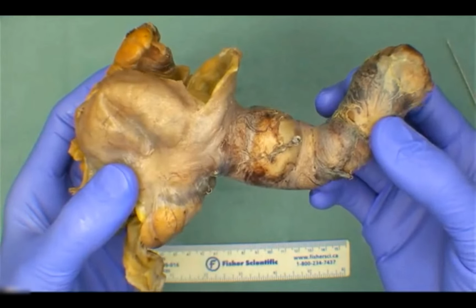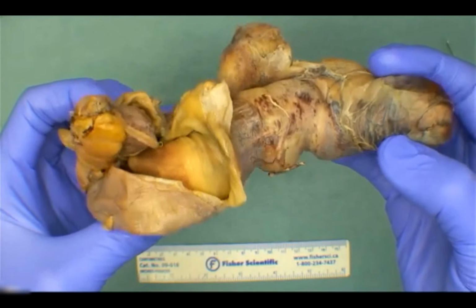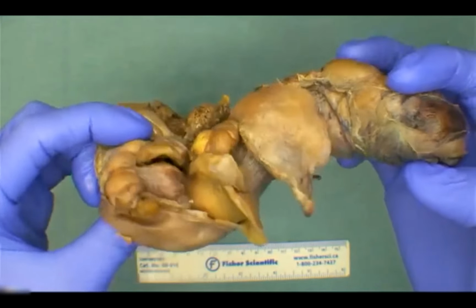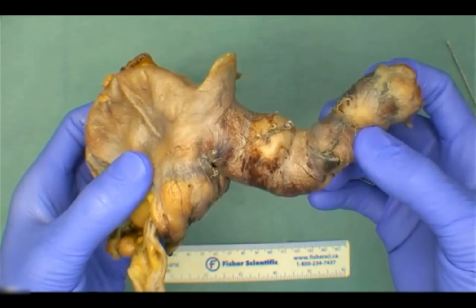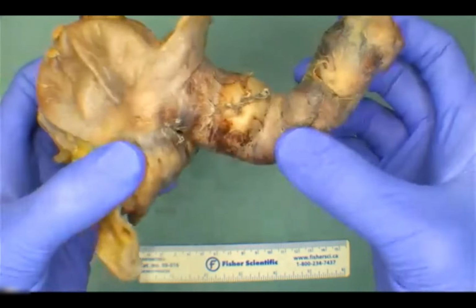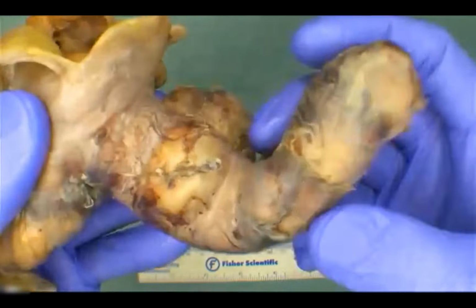So we've got a dilated appendix. Absolutely. What else? What are some other descriptors? Yes, it does have a phallic appearance, and it is slug-like instead of worm-like. Yeah, and so you saw with the appendectomy specimen, it looks like a smaller, thin worm, and this is a little bit more bulbous and definitely much more dilated. So it's intact. Okay, is it firm or squishy?